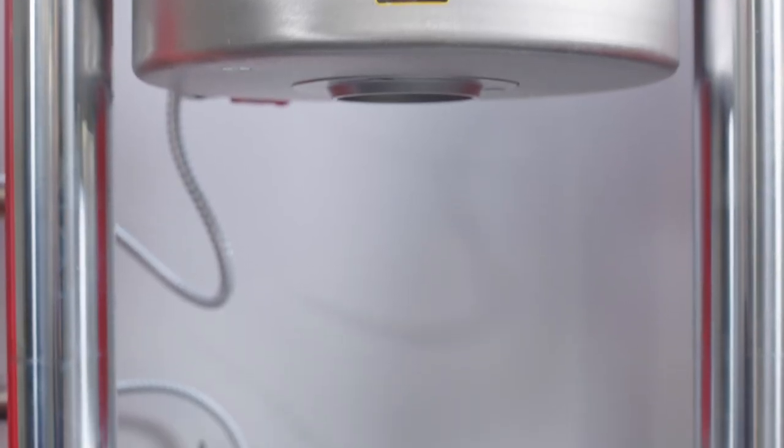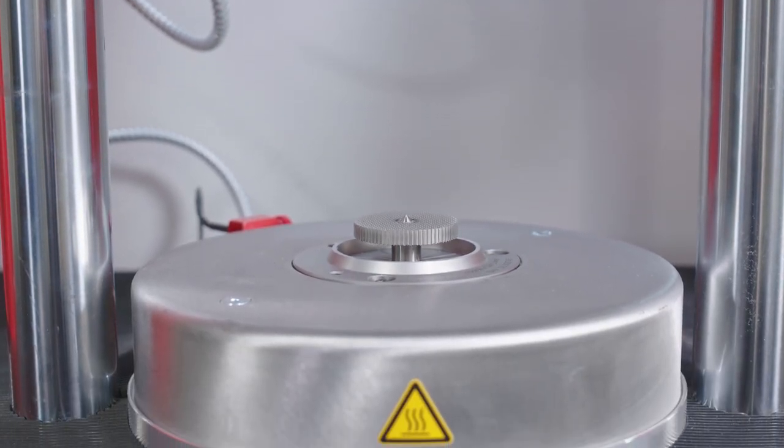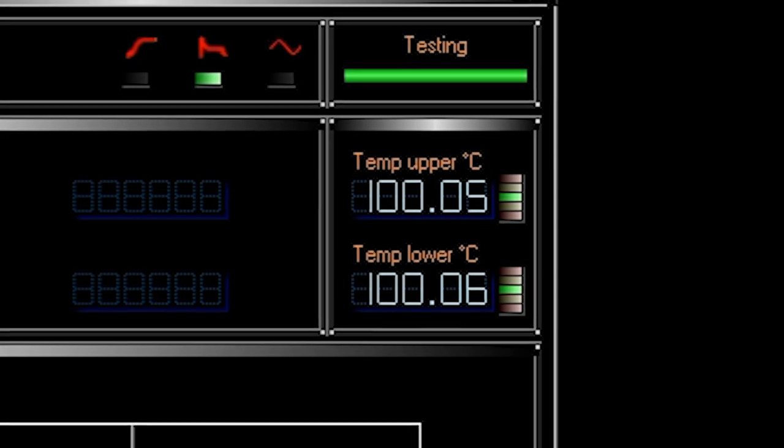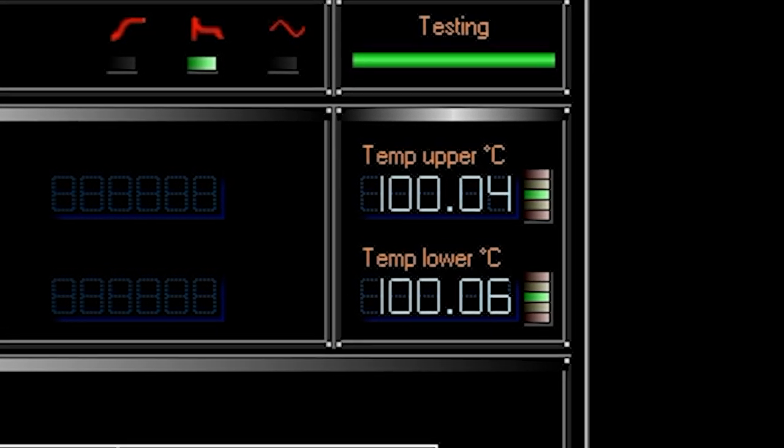The instrument is outfitted with highly precise PT100 resistance thermometers in both the upper and lower dies, allowing the temperature of both dies to be independently controlled and monitored up to 232 degrees Celsius through MonControl software.